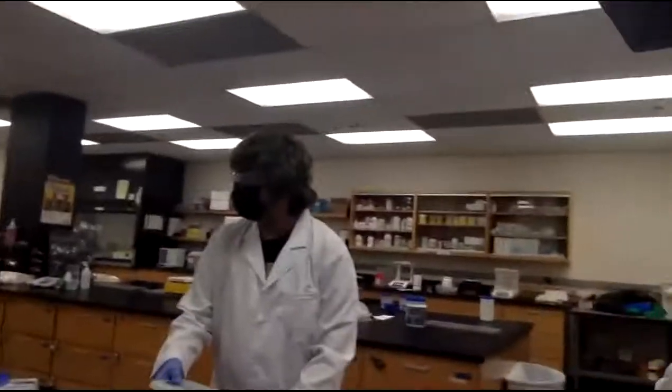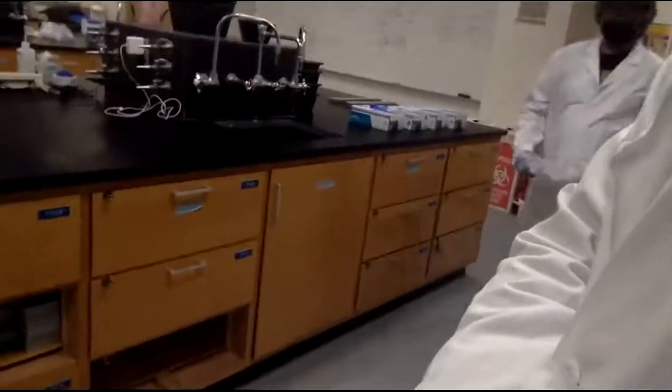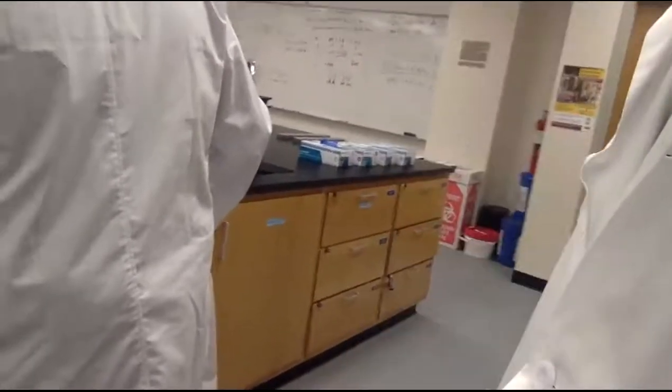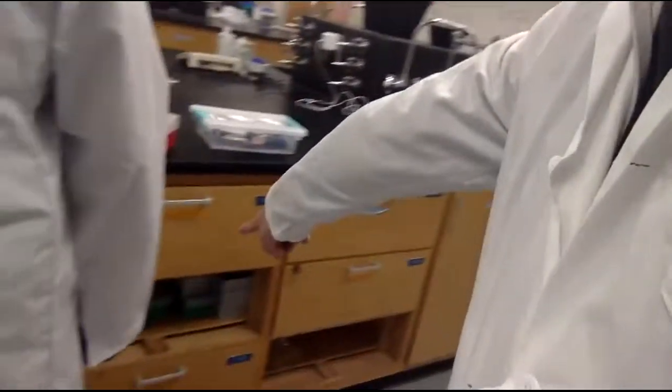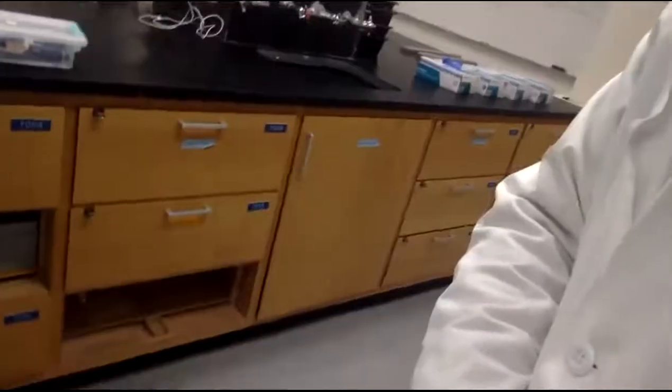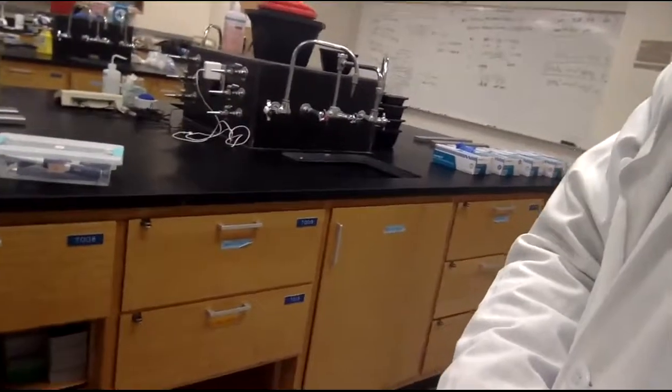So you just grab one, you just grab the whole box. Yes. And you need the pipette tips over there. No, it's right here in these drawers. You grab one box from each drawer, so 3 different sizes. And on the bottom, on the middle, this one, the green one. And one on the bottom. Okay. Okay, that's all you need.